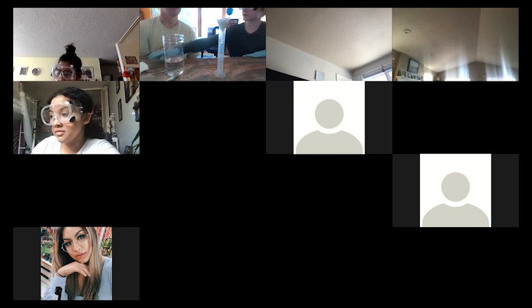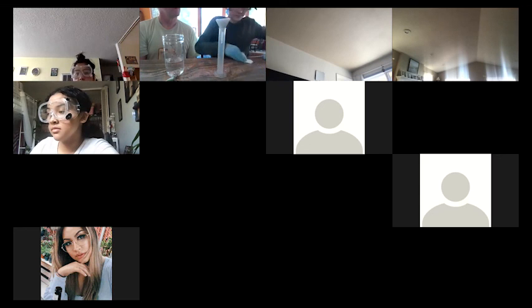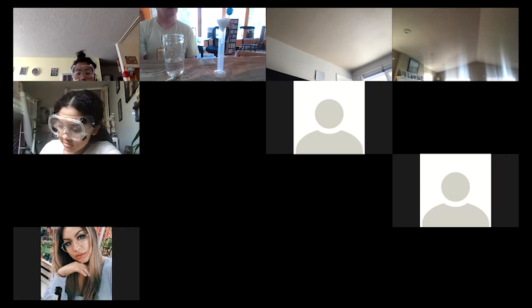All right, there's one more rinse. Yeah. And we'll start putting all this stuff away.